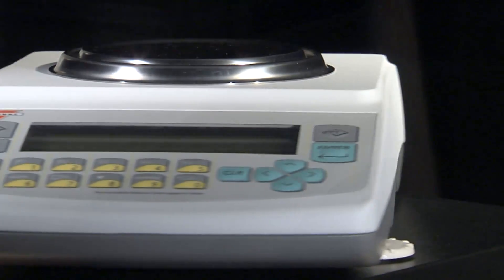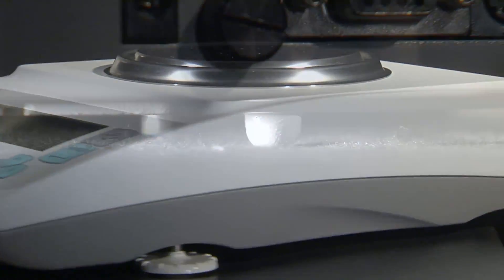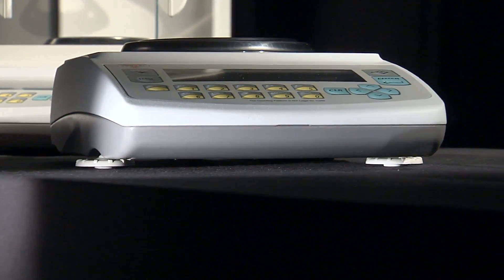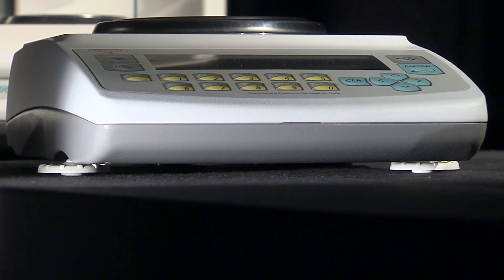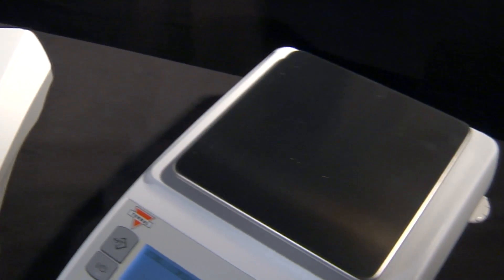The AG Professional line is built with a full die-cast metal housing that guarantees durability and long operating life. The base uses a tripod support system with one fixed leg in the rear and two adjustable legs conveniently located in the front of the balance.